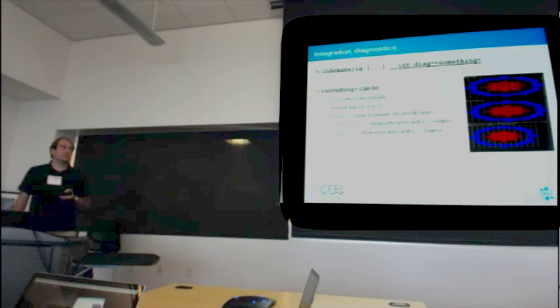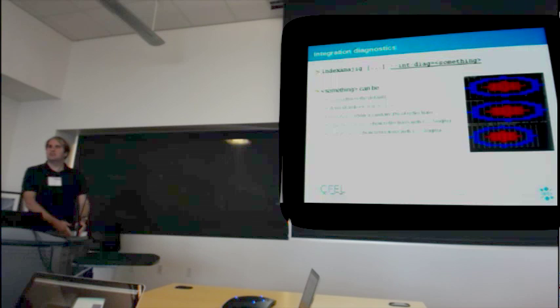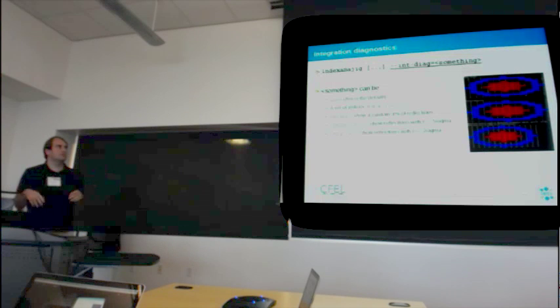What's always been the case when I've seen this happen is that there's been a bad pixel that hasn't been masked somehow. So maybe you need to change your peak finding options or mask out the region. So there might be a single pixel with zero intensity. In the background are many thousands of photons, and this will give it a very negative value. It doesn't happen routinely. The integration results do seem to obey the expected statistics according to the signals.